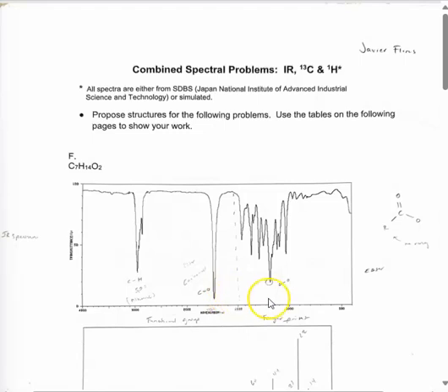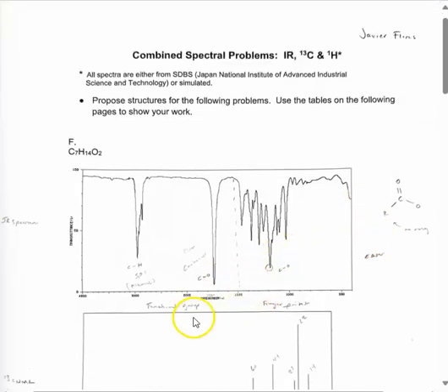The next functional group is roughly around the 1190 range, and here we would see a carbon single bonded to an oxygen. So based off of the data, we can deduce the presence of an ester, considering that we have an alkane group, a carbon double bonded to an oxygen, and a carbon single bonded to an oxygen, which I went ahead and rough sketched over to the right based off the data.